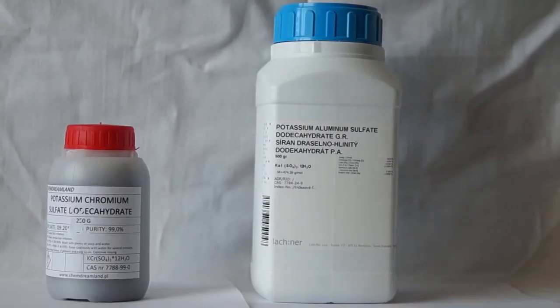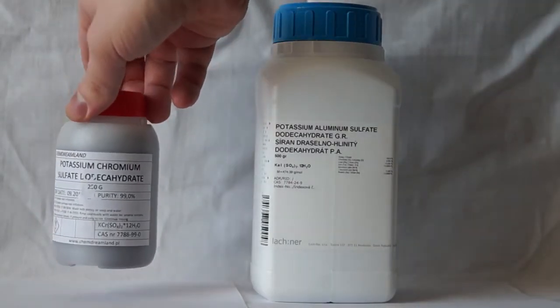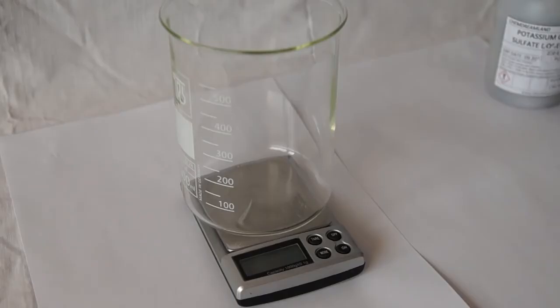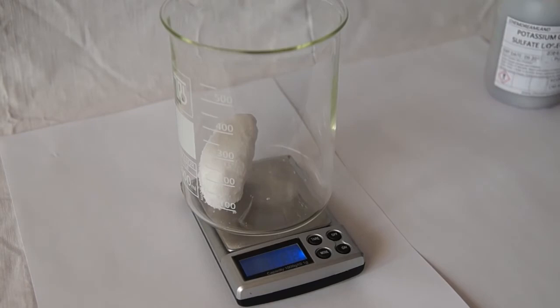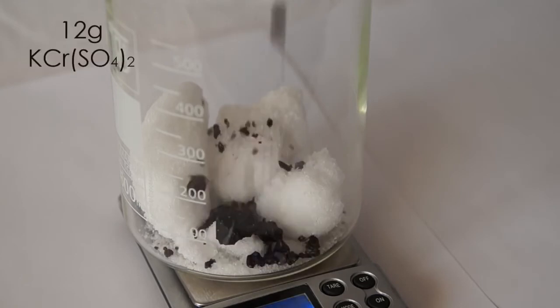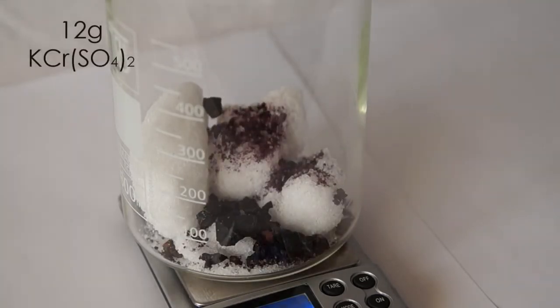For this we will need the following substances: potassium alum and chrome alum. To begin, let's make a mixture of alum. Take a glass and weigh 100 grams of aluminum potassium sulfate and 12 grams of chromium potassium sulfate in it.